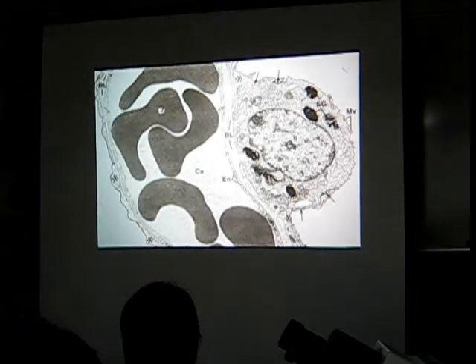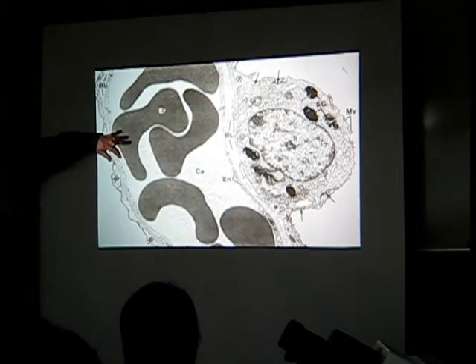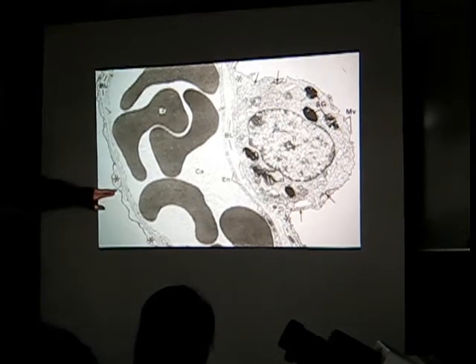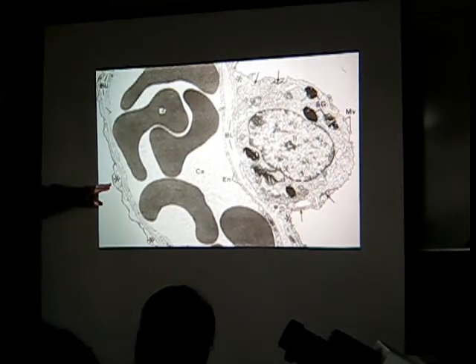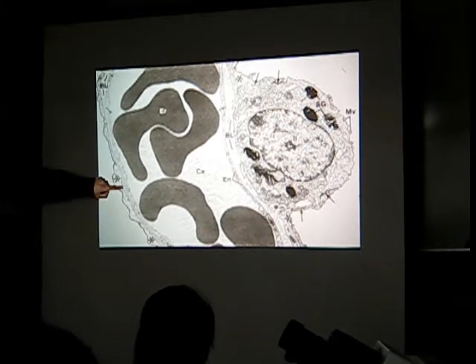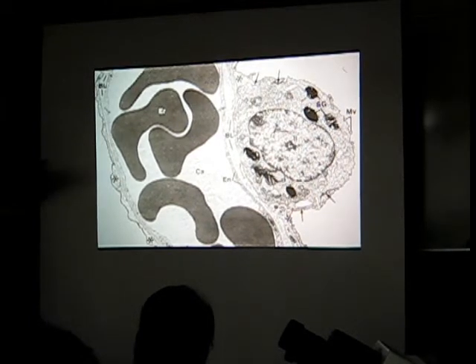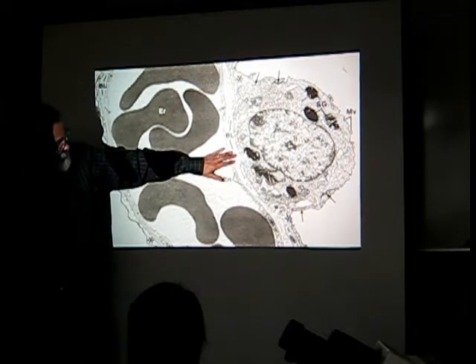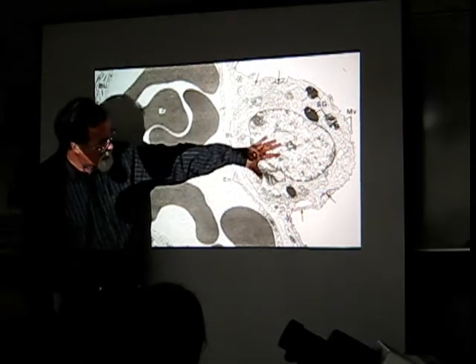So here's again a micrograph I showed you. So really pretty attenuated, which is what you'd expect. So the asterisk is in the cytoplasm of the type 1 pneumocyte. The surfactant has been removed during processing. We've got a space where we have that fused basal lamina, endothelial cell cytoplasm. Over here we can see the endothelial cell, thicker basal lamina, and that type 2 cell.